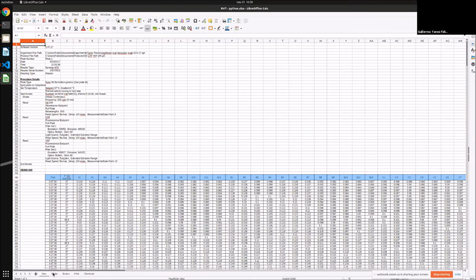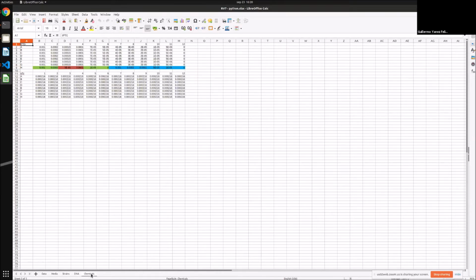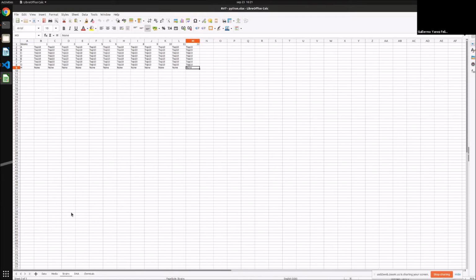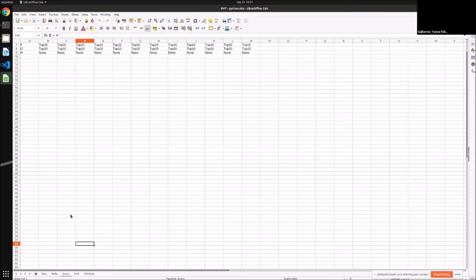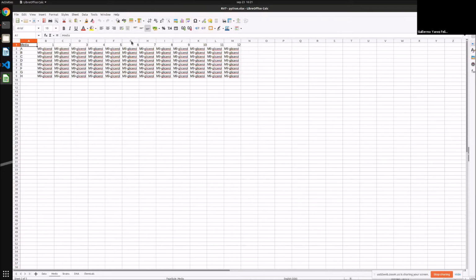It's separated into sheets. You can have more than one chemical, meaning any chemical: antibiotic, inducers, etc. Cell-free compounds. DNA, you can have more than one DNA. Strains, yes, good question, we can have more than one strain. And media, just one, which is basically the recipe. And if you put none, this well won't be uploaded.